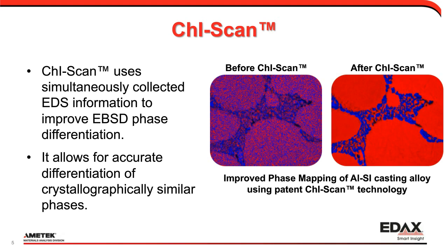Now, chi-scan, of course, is its own little thing. I'm going to basically show you in this how to not use chi-scan to do chi-scan, and I'll show you why and how that's done.